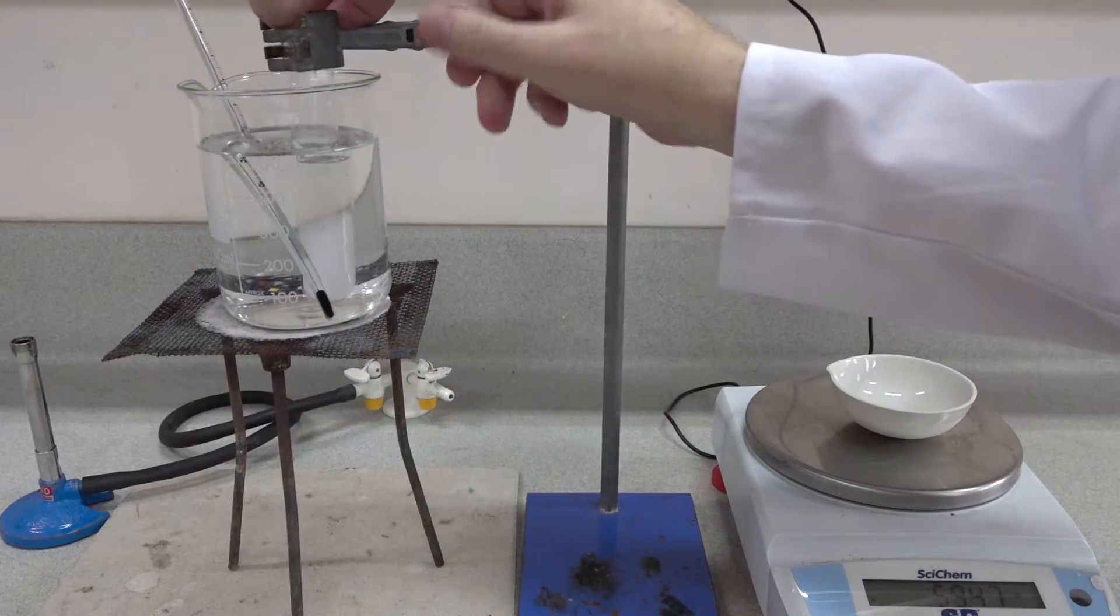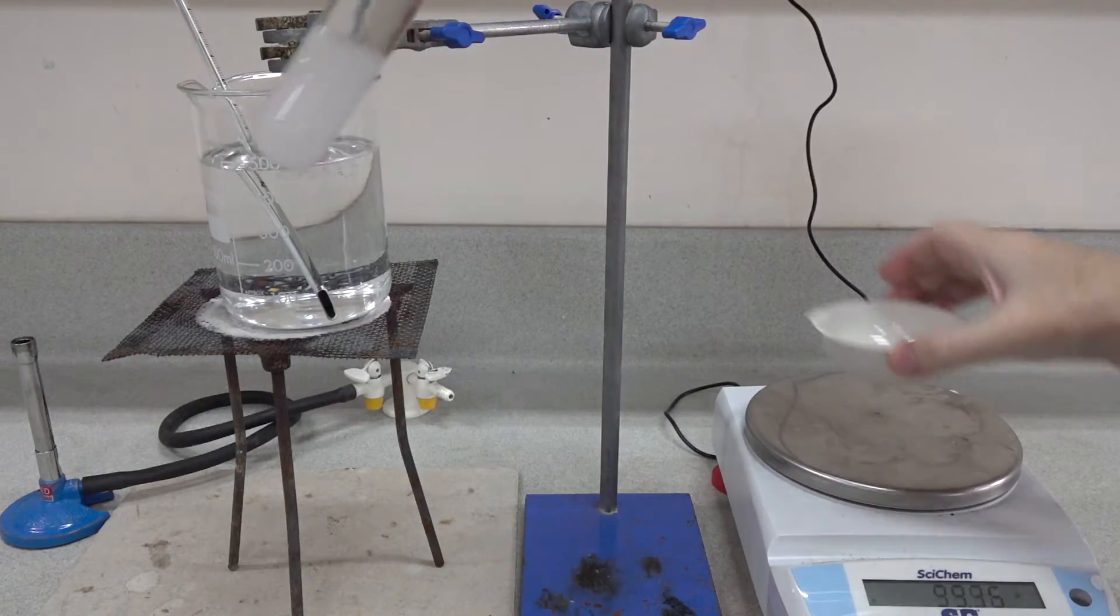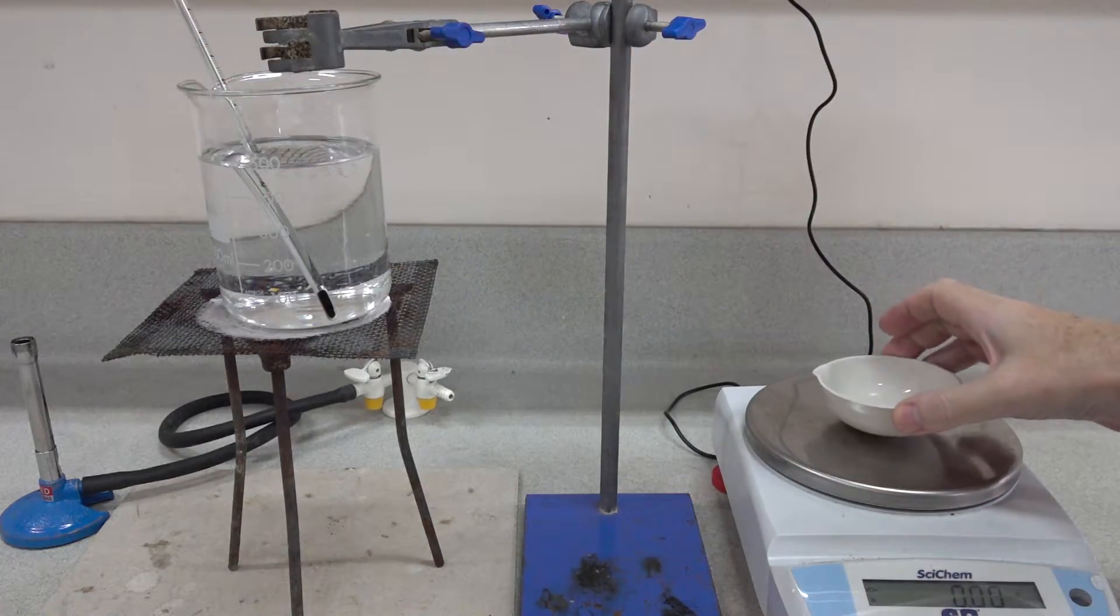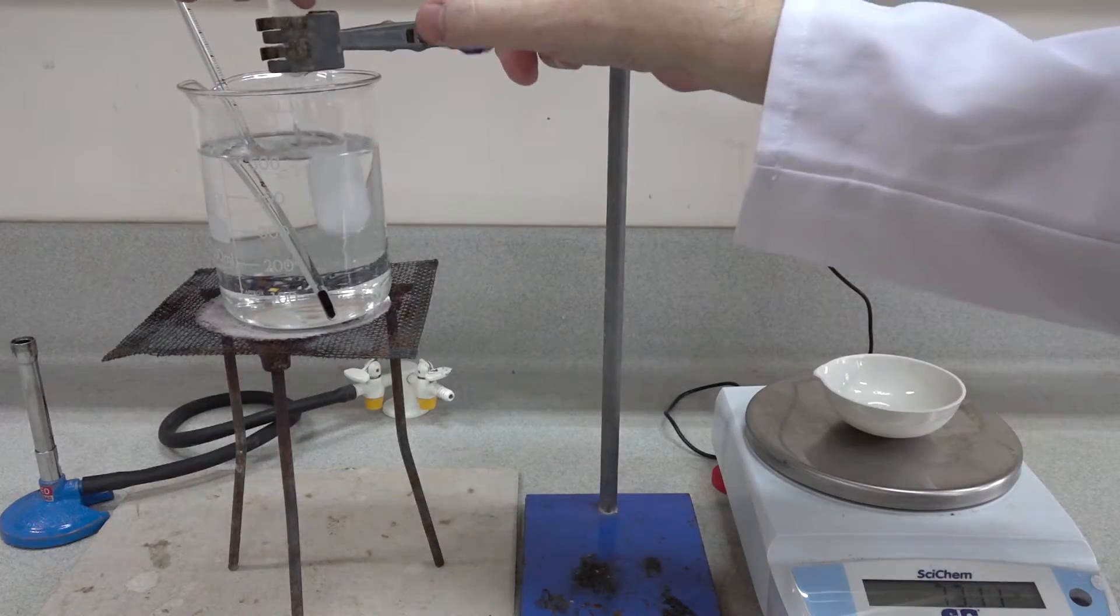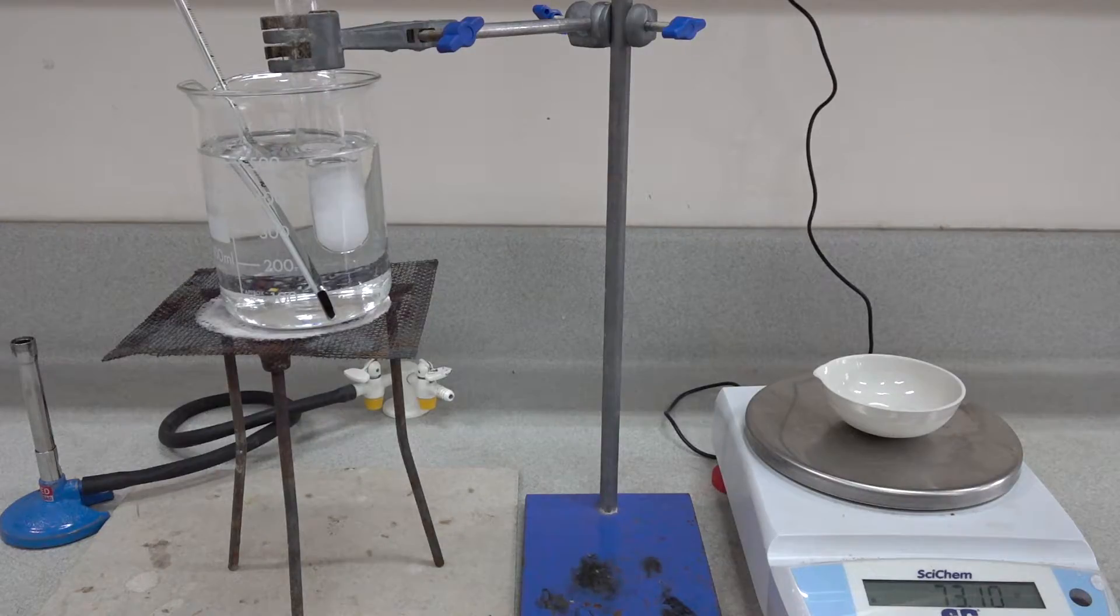We move the boiling tube and all we need to do is to pour a small amount into the evaporating basin but not any of the solid. The reading is now 73.10 grams.